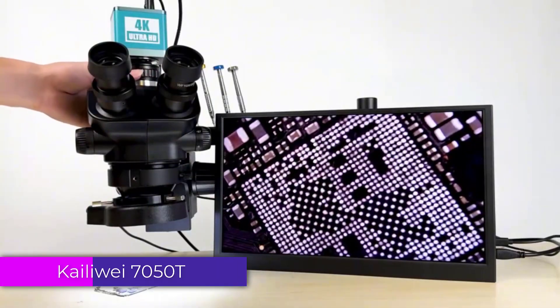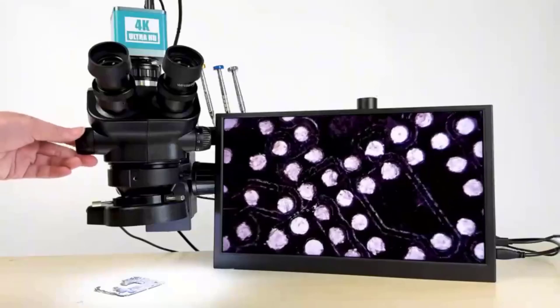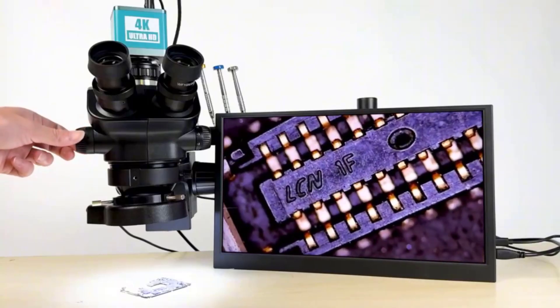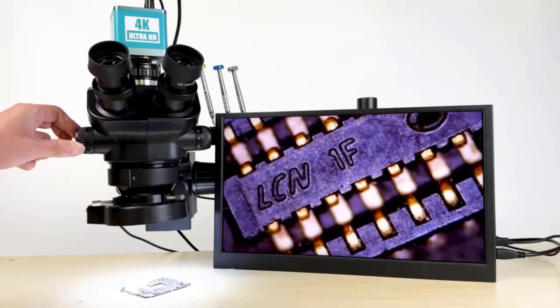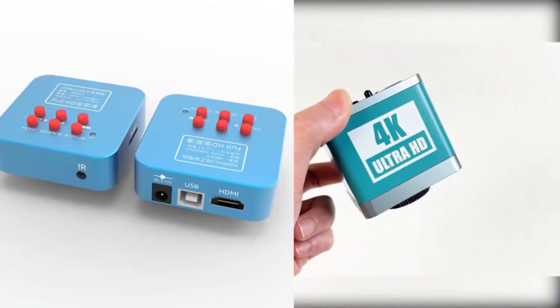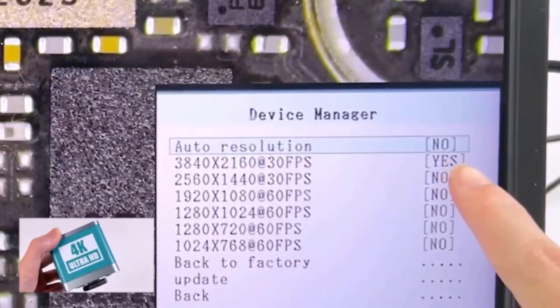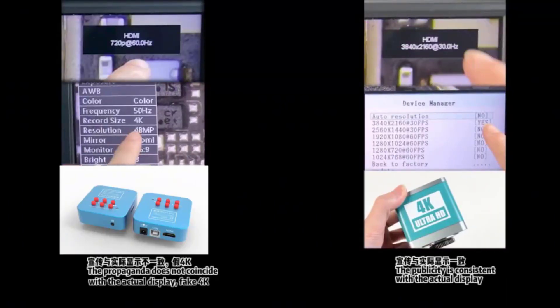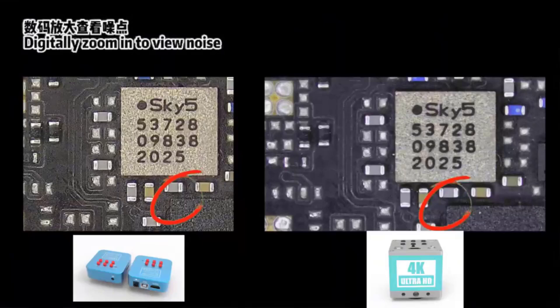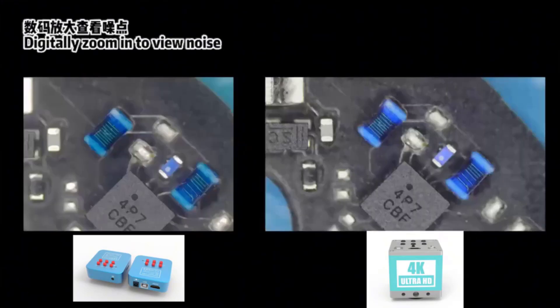Number 2. Kylaway 7050T Stereo Trinocular Microscope. The Kylaway 7050T is a versatile and high-performance tool designed for professionals in fields such as mobile phone repair, PCB soldering, jewelry inspection, and scientific research. This microscope stands out with its advanced features and robust build, making it a reliable choice for both industrial and laboratory applications. Its robust build, advanced optical features, and digital integration make it a valuable investment for anyone in need of a reliable, high-quality microscope, delivering the precision and clarity needed to perform at the highest level.